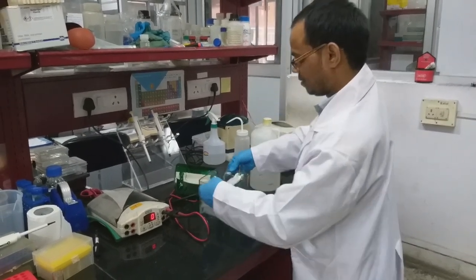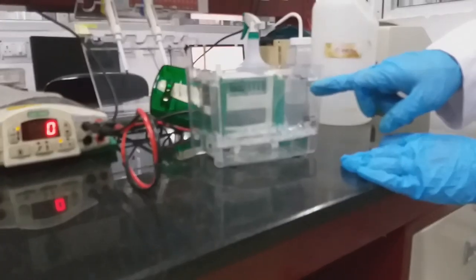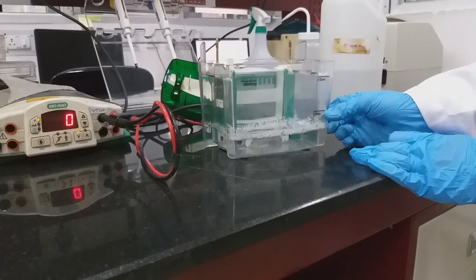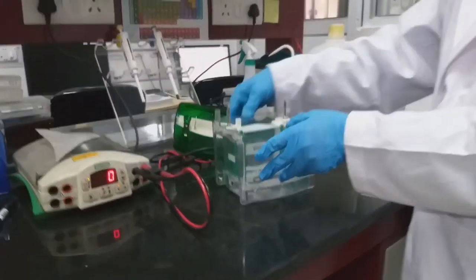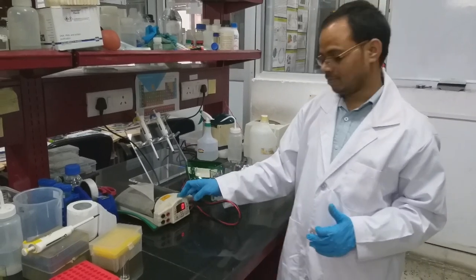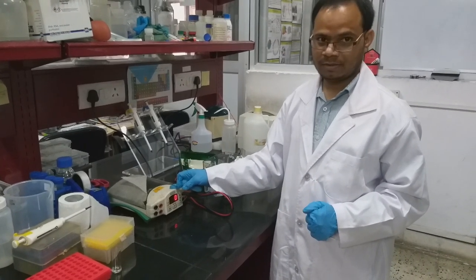For reference, you can see here, for 4 gels we have to add the buffer till here. We have to load outside this gel. So for 2 gels here, for 1 gel we can add like this. This is the power pack, where we can adjust how many volts we want to run.